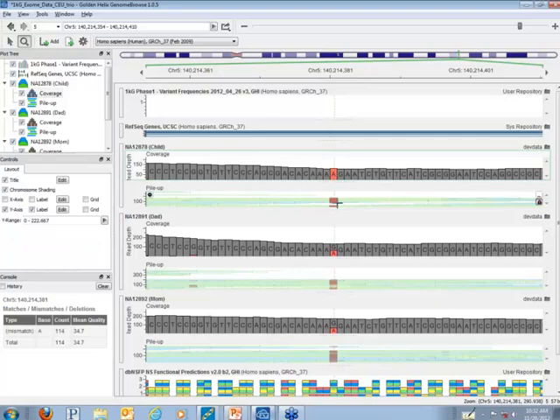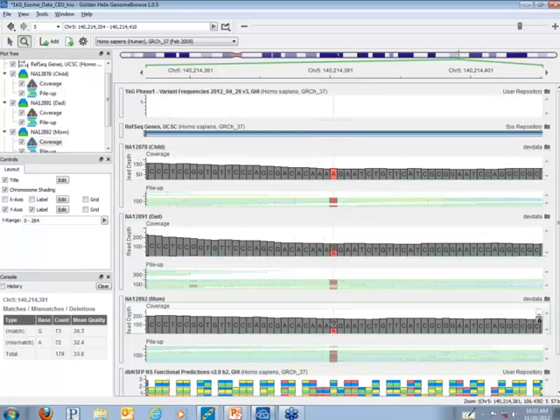Again, homozygous call. In fact, there were no reference calls, and both parents split about halfway between the G and the A for a heterozygous call. And we can again look at the 1,000 genomes track, but this time the variant is not within this track. All right, let's go ahead and switch back to our presentation.